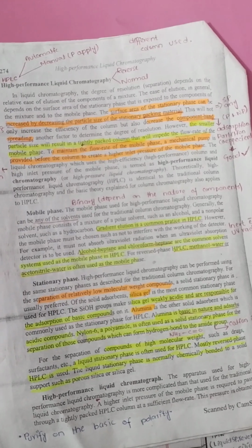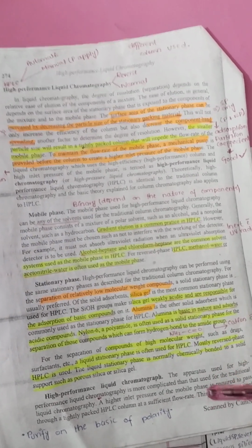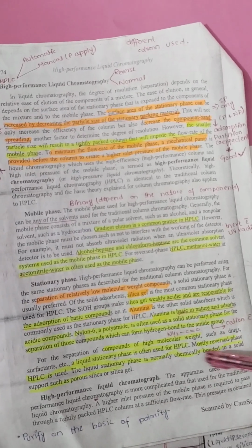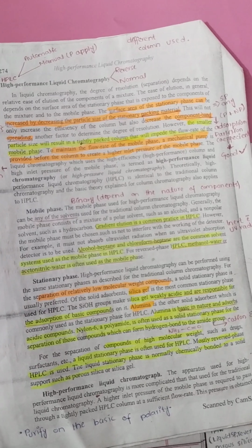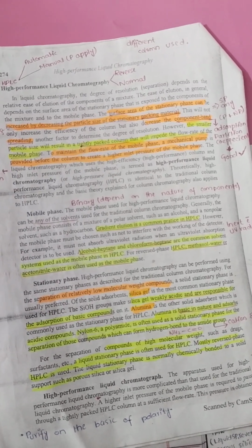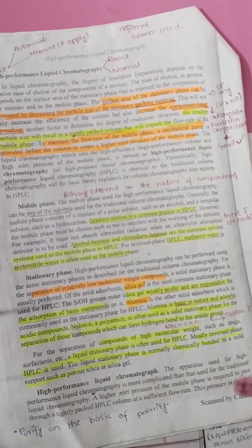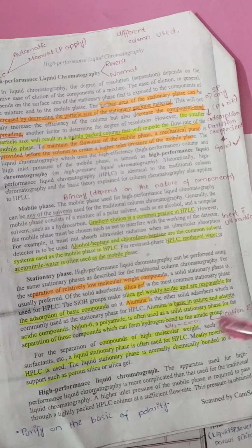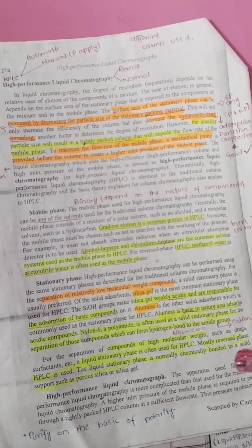For higher molecular weight compounds such as drugs or surfactants, we use a liquid stationary phase, and the liquid stationary phase is supported by a solid support, such as silica gel or porous silica. Now we discuss the instrumentation of HPLC.